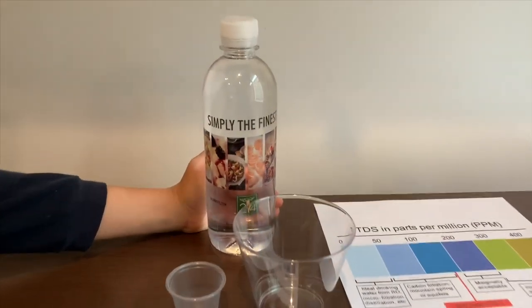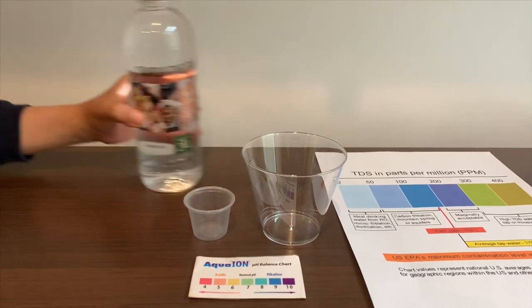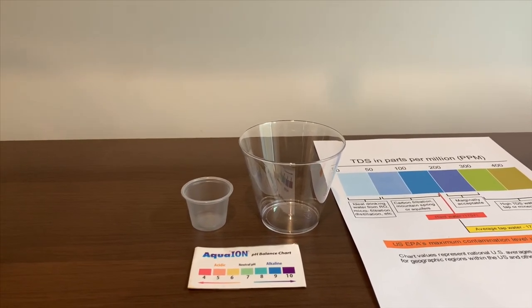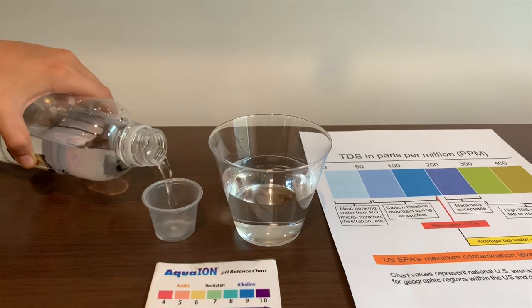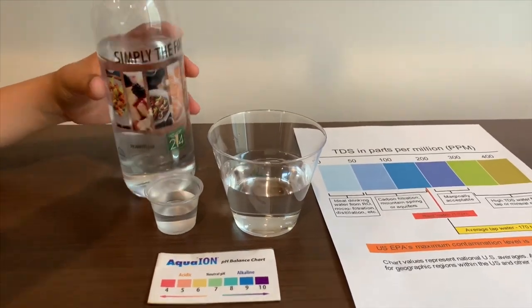This is 24 karats purified drinking water. Let's test the pH and TDS levels. Let's pour some water in. First we're going to test the TDS level.